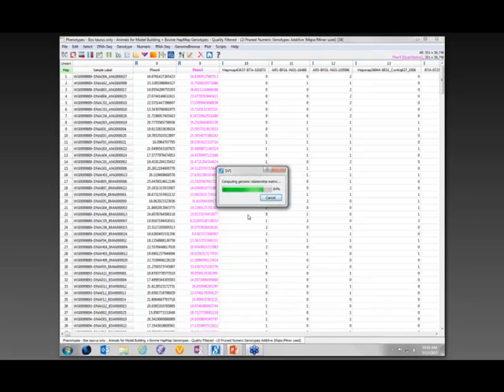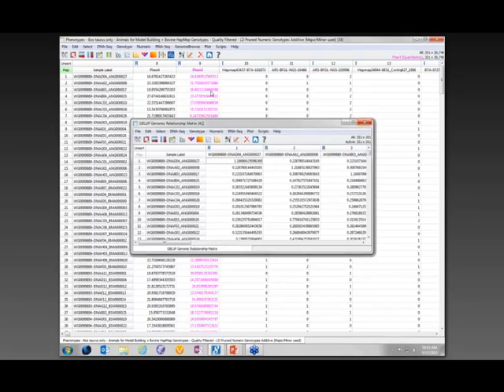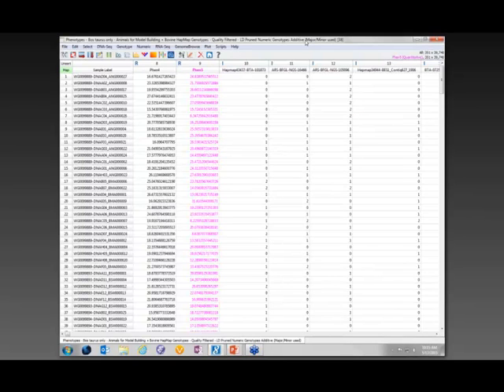And this is just the relatedness between samples, and we can see these two samples are, again, the same sample. It's a value of higher than 1. This is not a true identity by state matrix, so your values can be more than one. It's just a gradient on how much effect each allele has and how related they are.